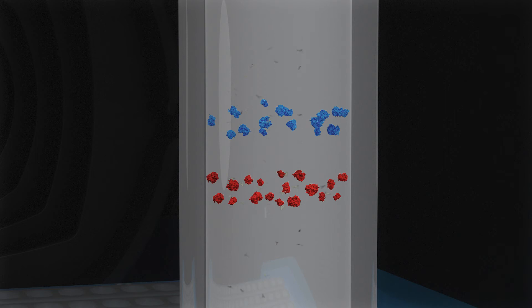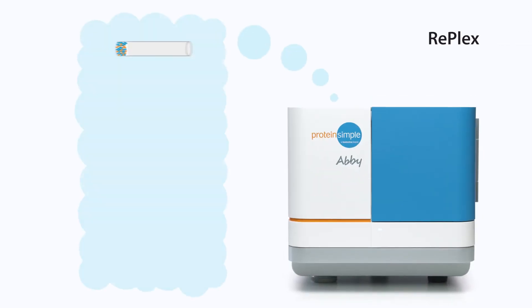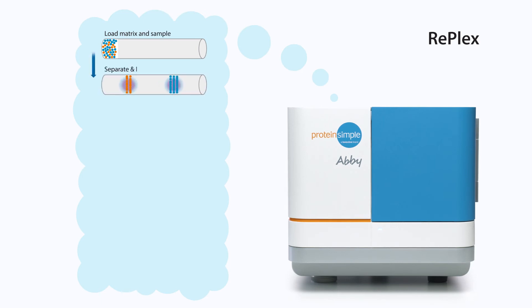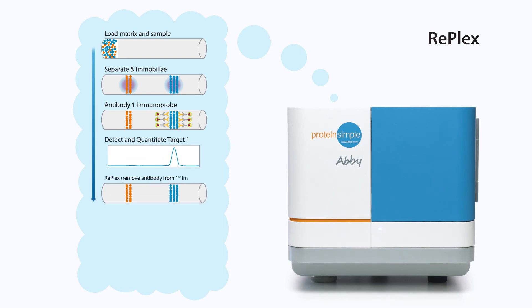Leaving the immobilized samples ready for a second round of immunoprobing. With the RePlex feature on Abby, you can run two immunoassays within the same capillary to get more protein characterization data from one sample, and even normalize your data with total protein expression data in the same capillary.